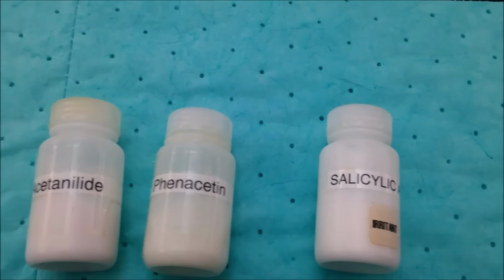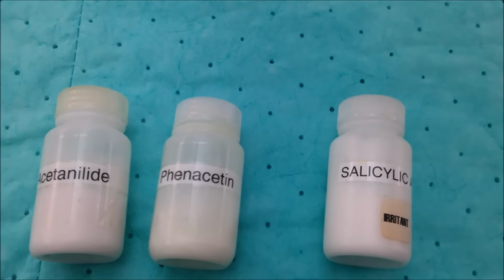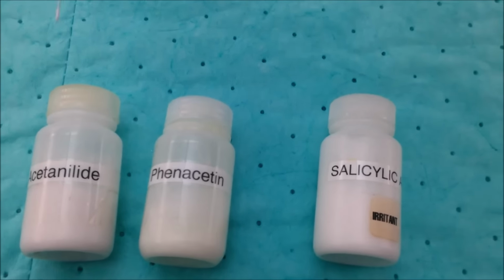Place a pea-sized amount of acetanilide, phenacetin, and salicylic acid into a separate test tube. Determine the melting point range of acetanilide, phenacetin, and salicylic acid. Record your results.